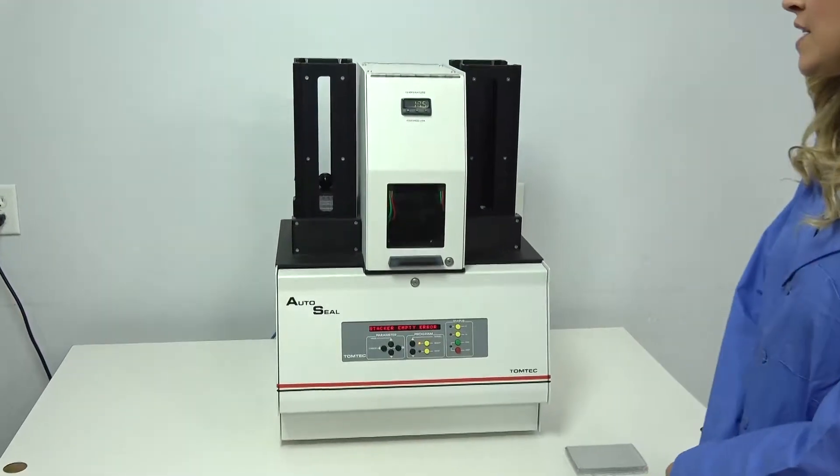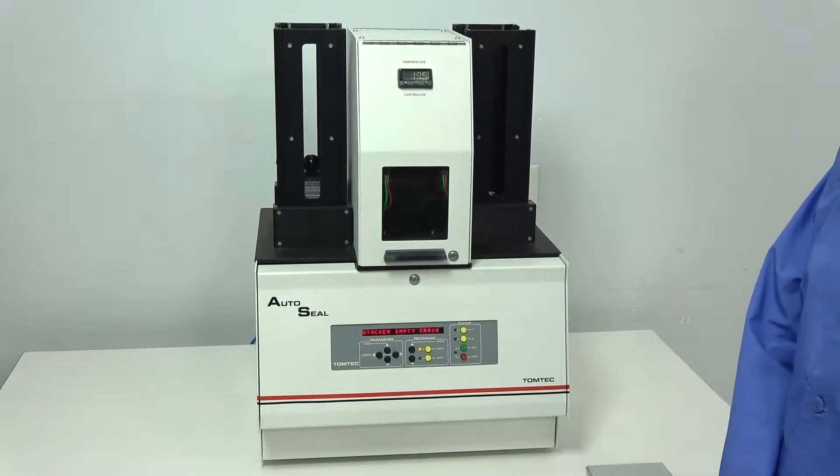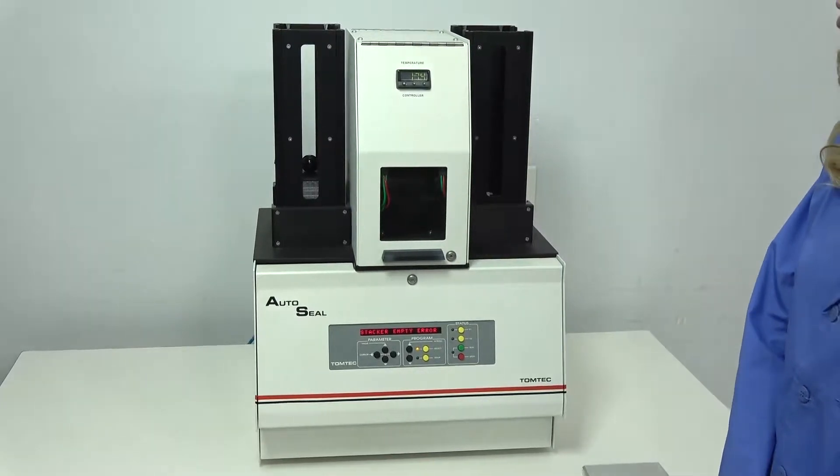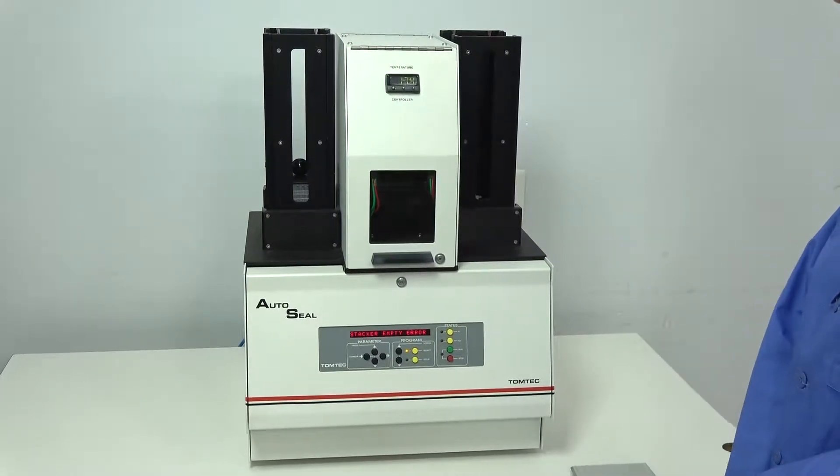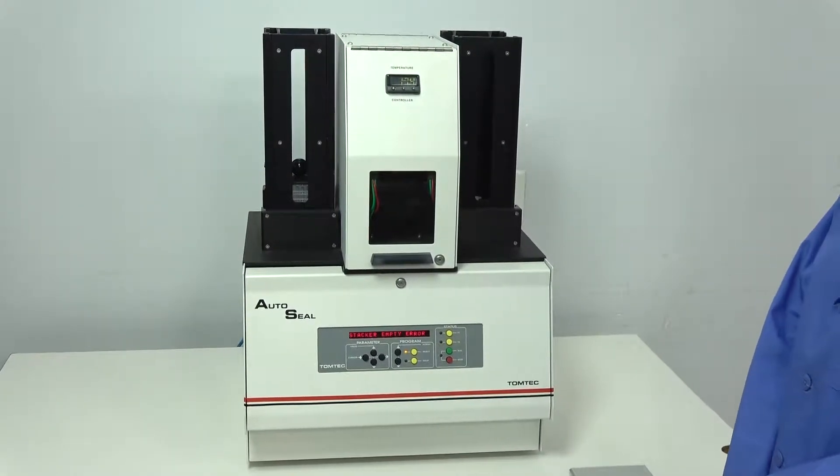This unit gives you the ability to quickly run your microplates. It will allow you to stack up to 25 microplates to run through fully automatically within about 10 minutes.